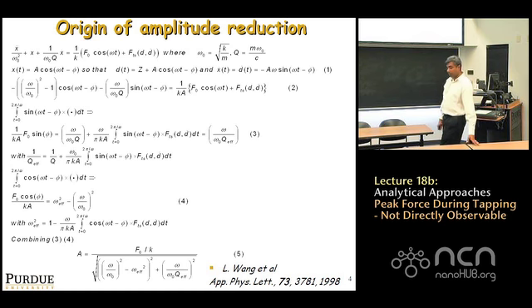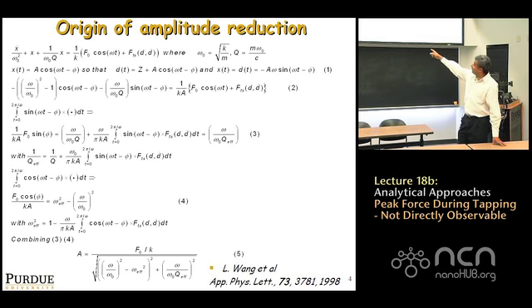So what they're saying now is, let us say that the tip sample interaction forces are somehow changing the effective natural frequency of the cantilever also. So it's a grouping of terms. Let's call this omega effective now. But now you have to keep in mind that this omega effective depends on the interaction forces, right? It depends on what the properties are of the sample, okay? Both things.